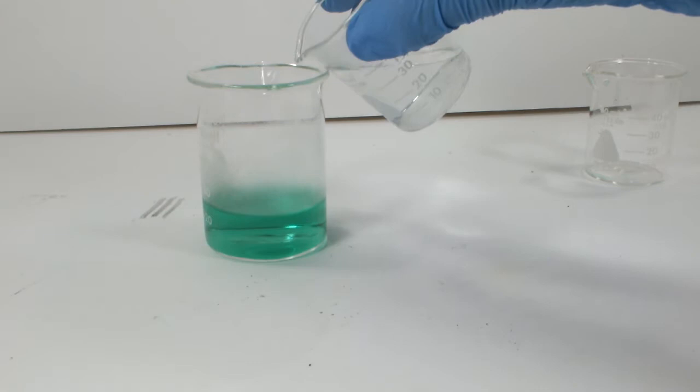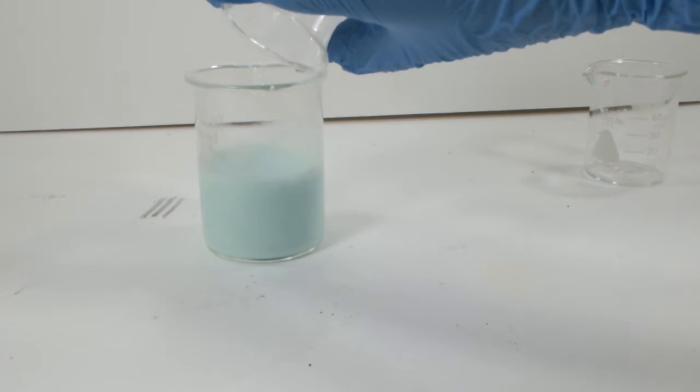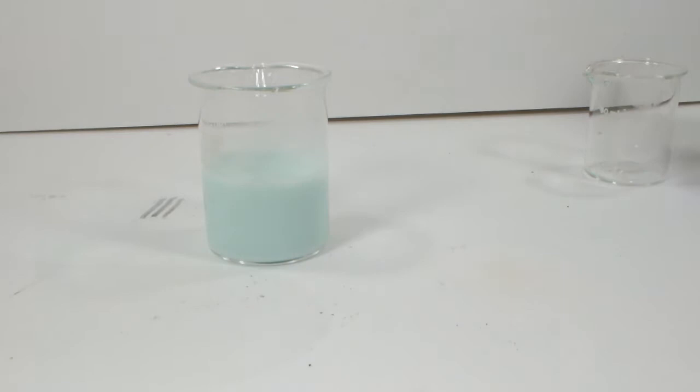As soon as the barium chloride goes in, you can see a very fine precipitate of barium sulfate. Since I'm going for quantitative yield, every last drop has to come out of the beaker.